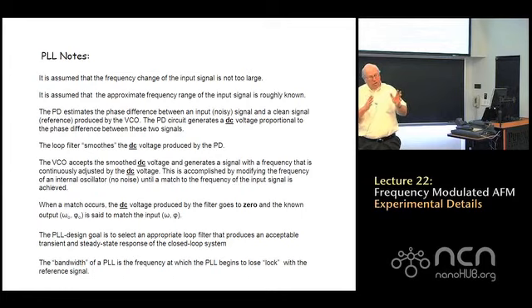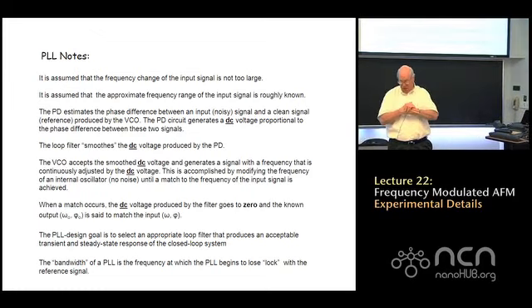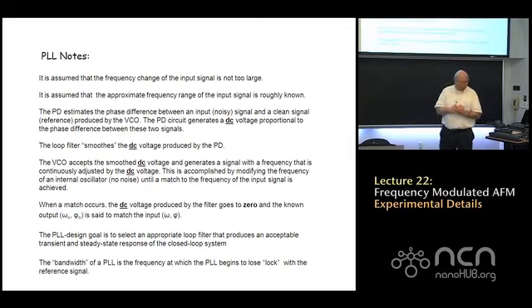It also assumes up front, these phase lock loops also assume up front that you know roughly what the input frequency is. Right? So you can't just put any old frequency in. You've got to know it's an input frequency within a certain range, and that range is determined by the way the feedback loop and the phase lock loop works. Right? So you need to know certain things. Once you know those things, you need to know roughly the input frequency, and you've got to know that the input frequency doesn't change much during the course of an experiment. Then these things really work well.